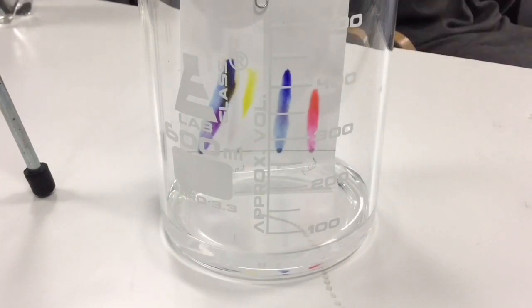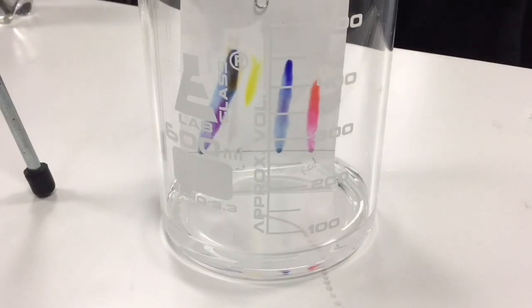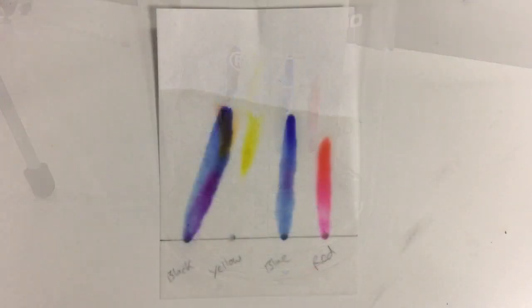This time-lapse video shows how the inks are separated over a period of 10 minutes. Once the inks have moved roughly two-thirds of the way up the paper you should remove the paper and allow it to dry.